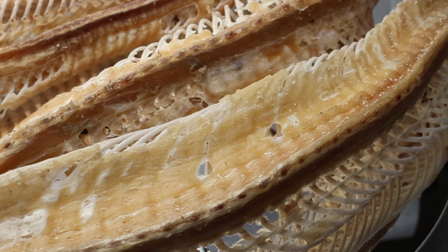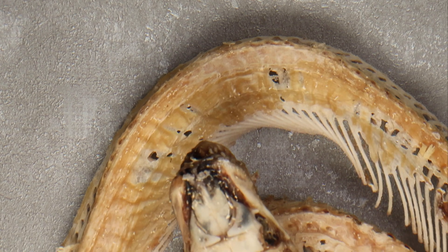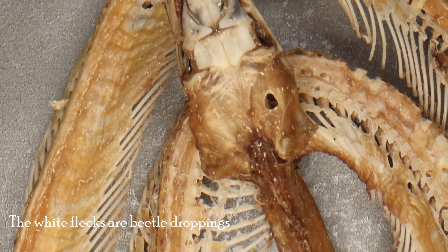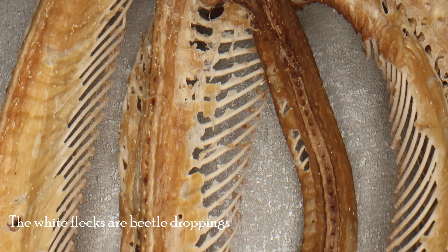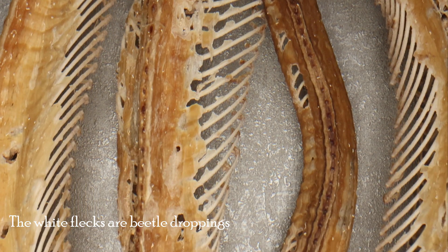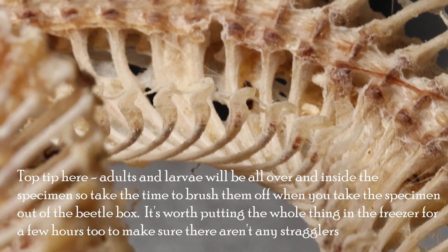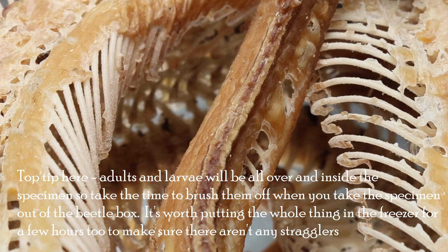After a period of time that's largely dependent on how many beetles you have, the skeleton will be picked clean. This is the boa skeleton as it is now — not quite done but not a million miles off. While there is still some flesh on the skeleton you can see the muscle fibres running lengthwise along the body that the snake contracts to move or grip something. You can see the lower levels have been eaten first and that's because the specimen was partially buried under the wood shavings I use as substrate. The beetles do venture above ground though to have a nibble from the top.